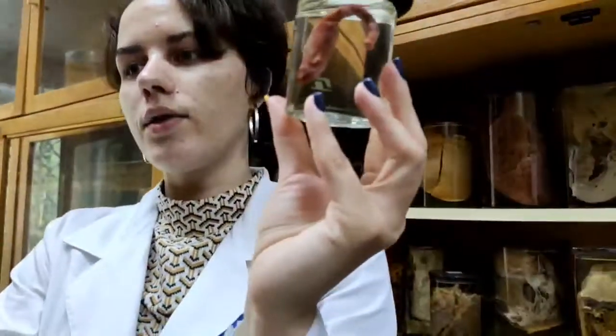It's red. And when do we call inflammation in the appendix phlegmonous? When we look under the microscope and see neutrophils infiltrating all the layers of the wall, from mucosa to serosa, that means this is phlegmonous inflammation. When we see, for example, a defect of the wall down to muscularis propria, deeper than muscularis mucosa, we call it ulcerative appendicitis. When we see inflammation just in the mucosa, not involving serosa or any other layers, we call it surface appendicitis or catarrhal appendicitis.